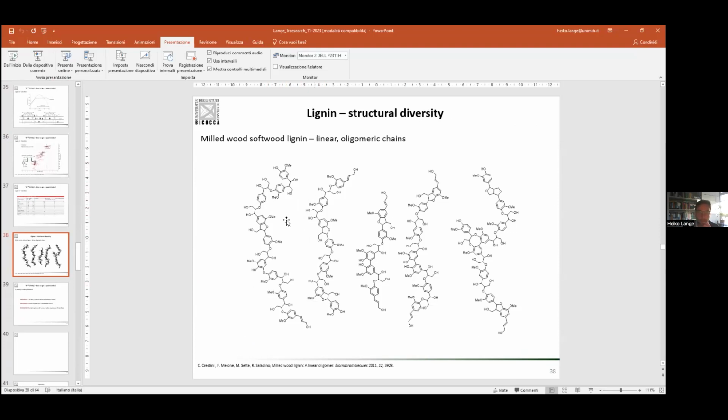In a lignin structure, we have the OH functionalities, which are very, very important because the phenolics give us all the characteristics of the polymer as such, right? And then we have the aliphatic OH groups, which might give us a handle for functionalizations, etc. So these OH groups can be seen in a proton NMR, but they are not clear in the proton NMR. For that, we run better a phosphorus NMR, so we can nicely get a qualitative and quantitative picture of the OH groups in the lignin. Okay, only the OH groups.